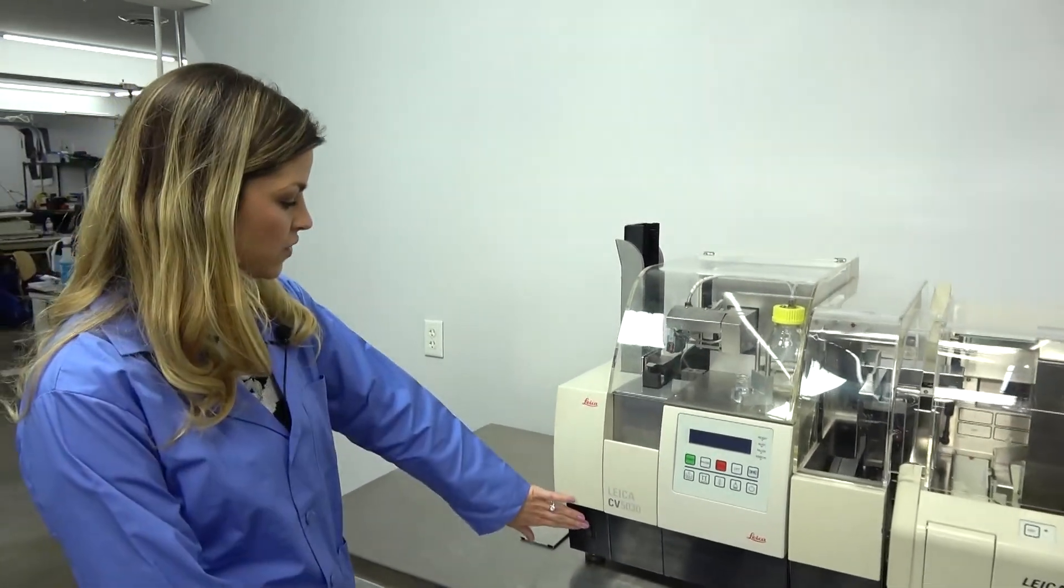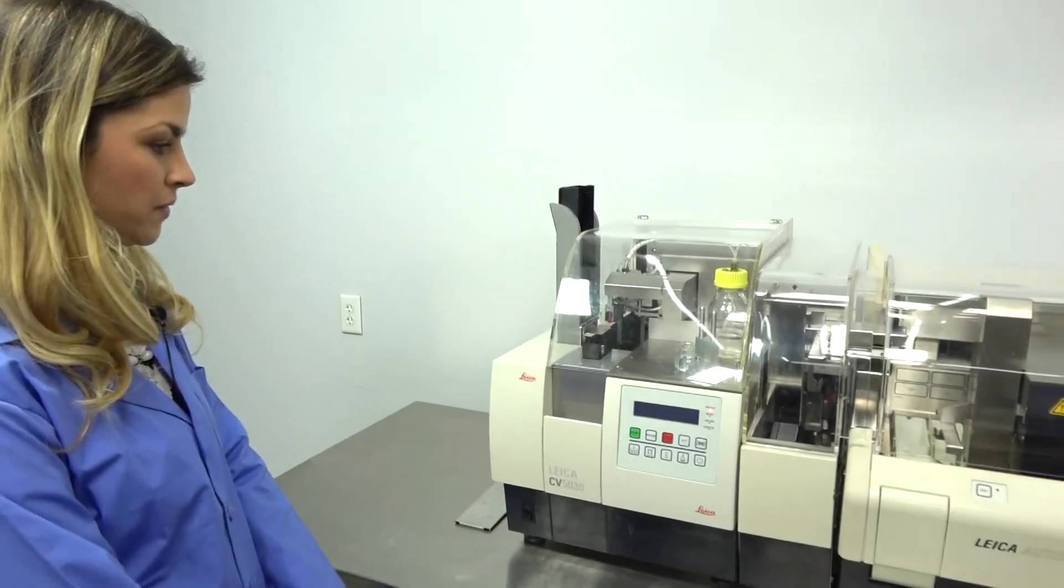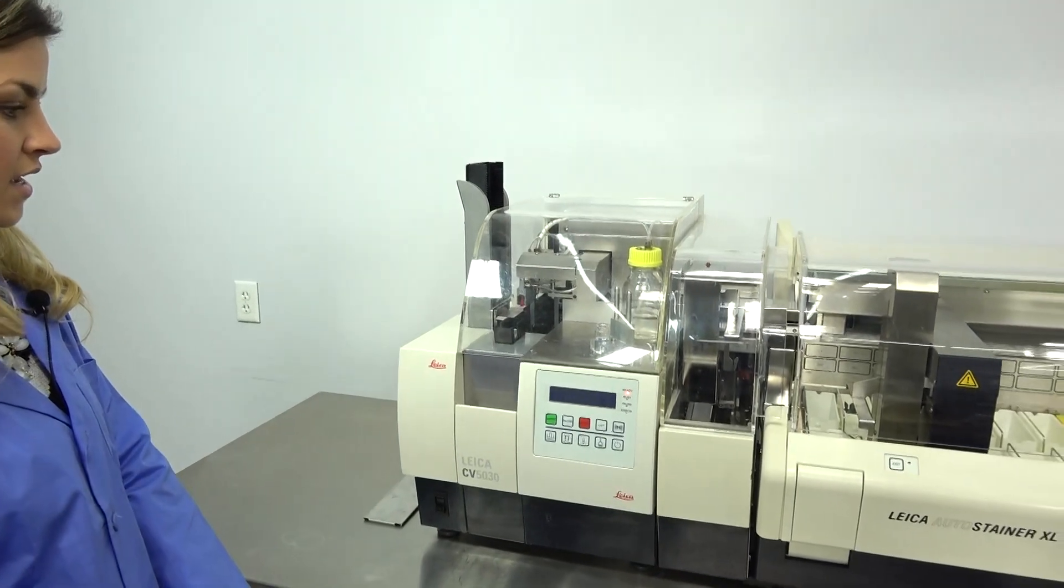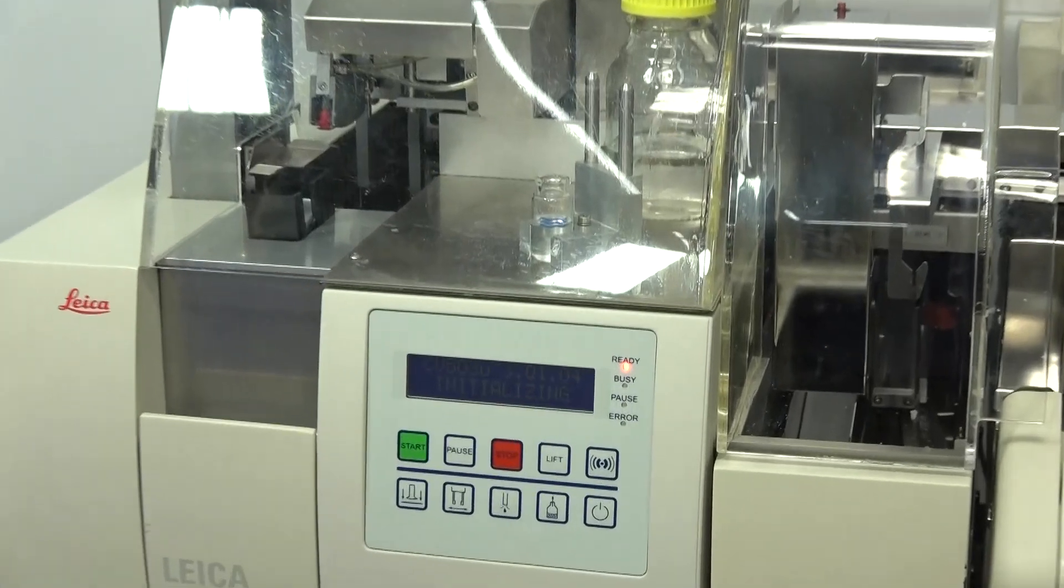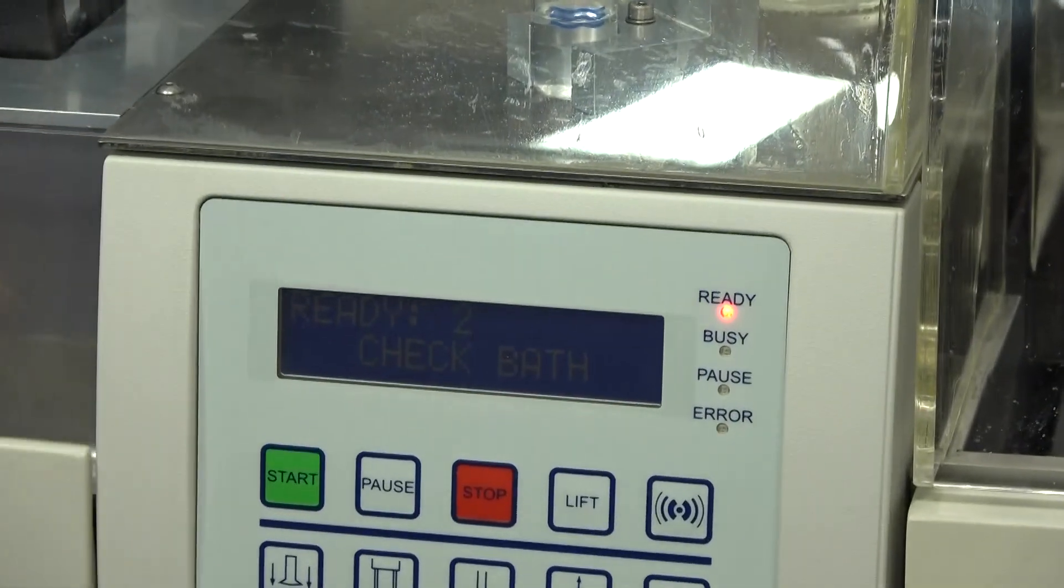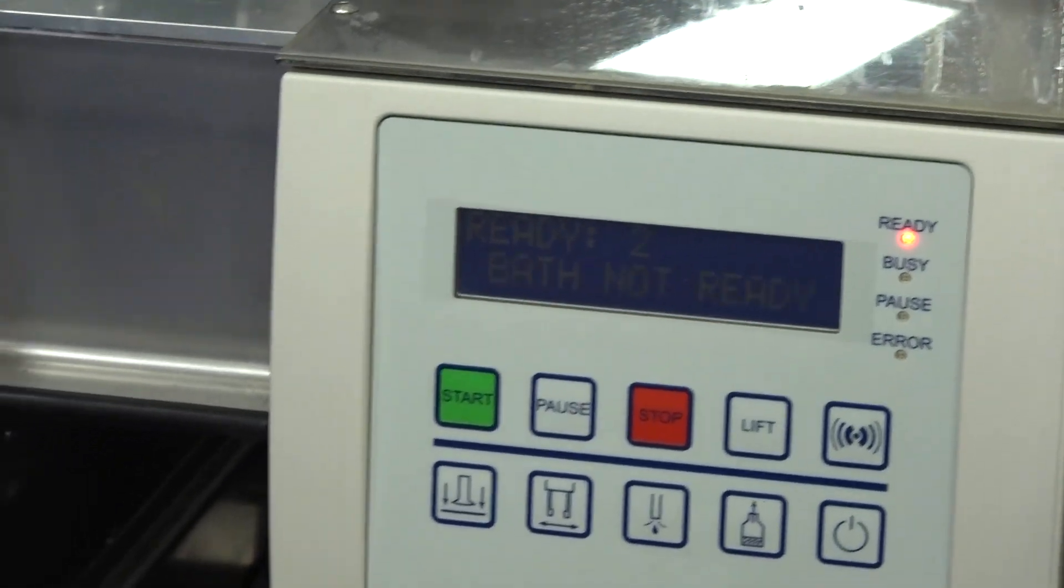To begin, you're going to initialize the Cover Slipper. Here on the digital display, it's going to tell you the initialization process. It's going to tell me to check the bath, which is located within this drawer, which you can easily pull out and close.